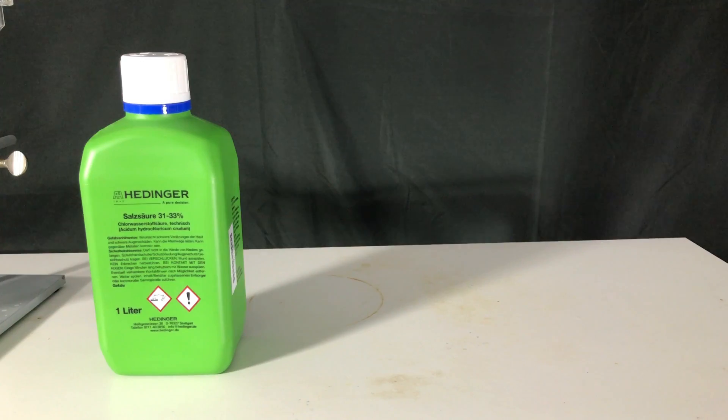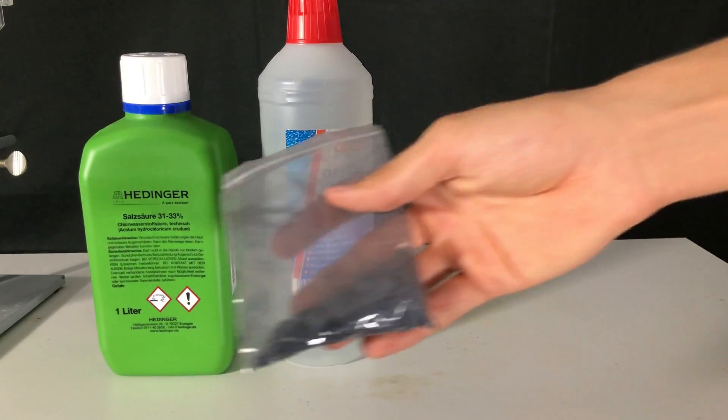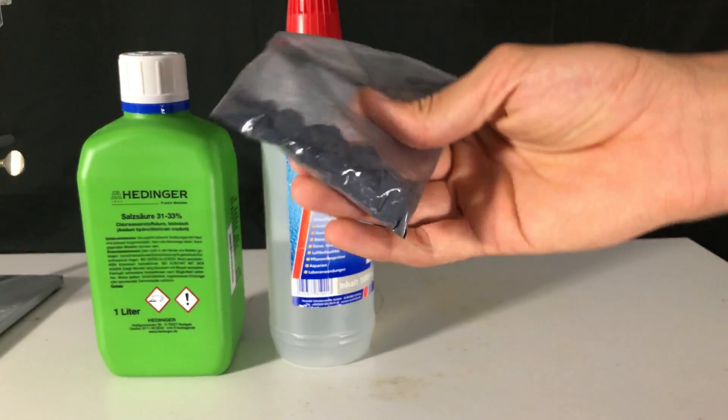Welcome back everyone, today we are going to prepare some silane gas. For this you will need hydrochloric acid, distilled water and some magnesium silicide.